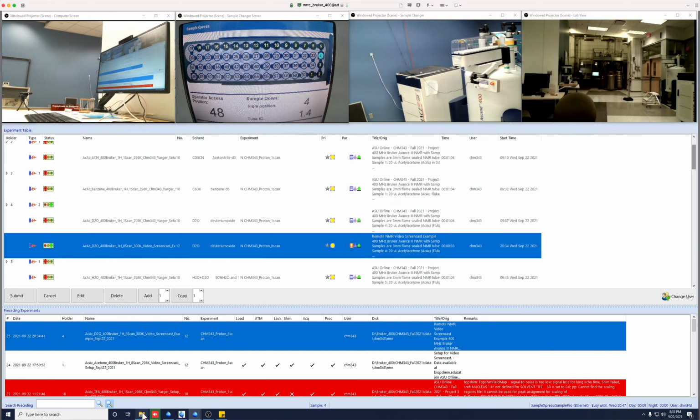You can access the data locally, but again, the primary objective is to collect the data, and we have services to automatically get that data to you. We will have different videos about how to process this data offline, etc. But that shows you initially how to set up an experiment on this.